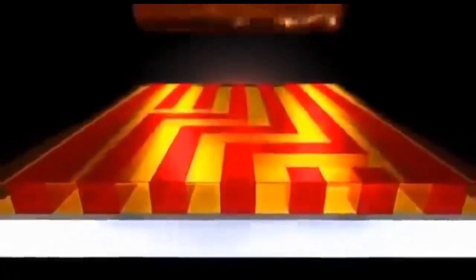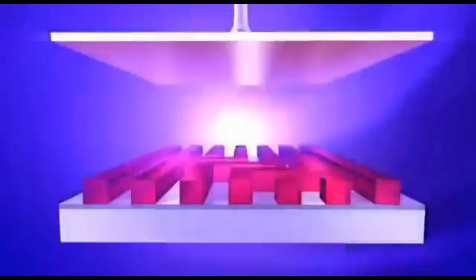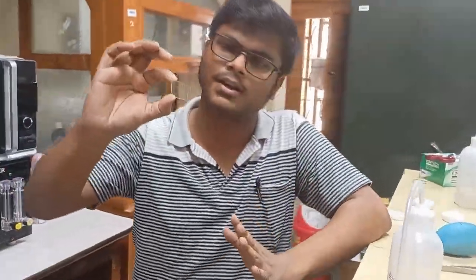to transfer any geometric patterns or design, but we need to take the help of an optical mask or a photolithography mask. Now, we use a chemical which is light sensitive. This chemical is called photoresist. A substrate like this you would see, though from the camera it can't be seen.